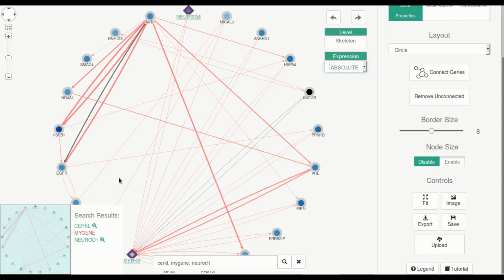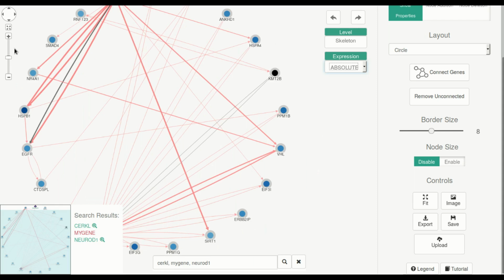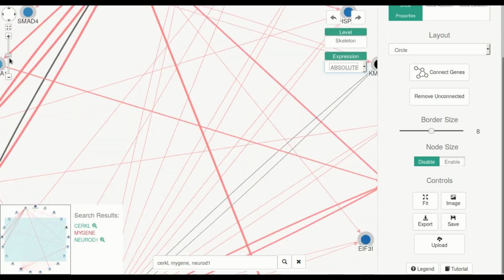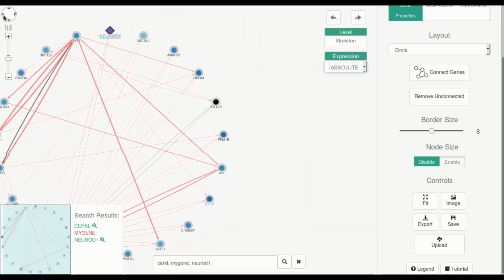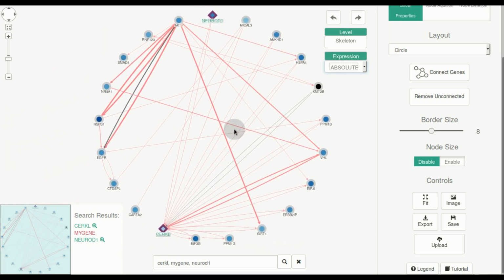And then here, you have the map that you can use to move around. This one's another fit button, and up and down, a zoom in, zoom out, and again, to move in, move out. All just options that you can use.